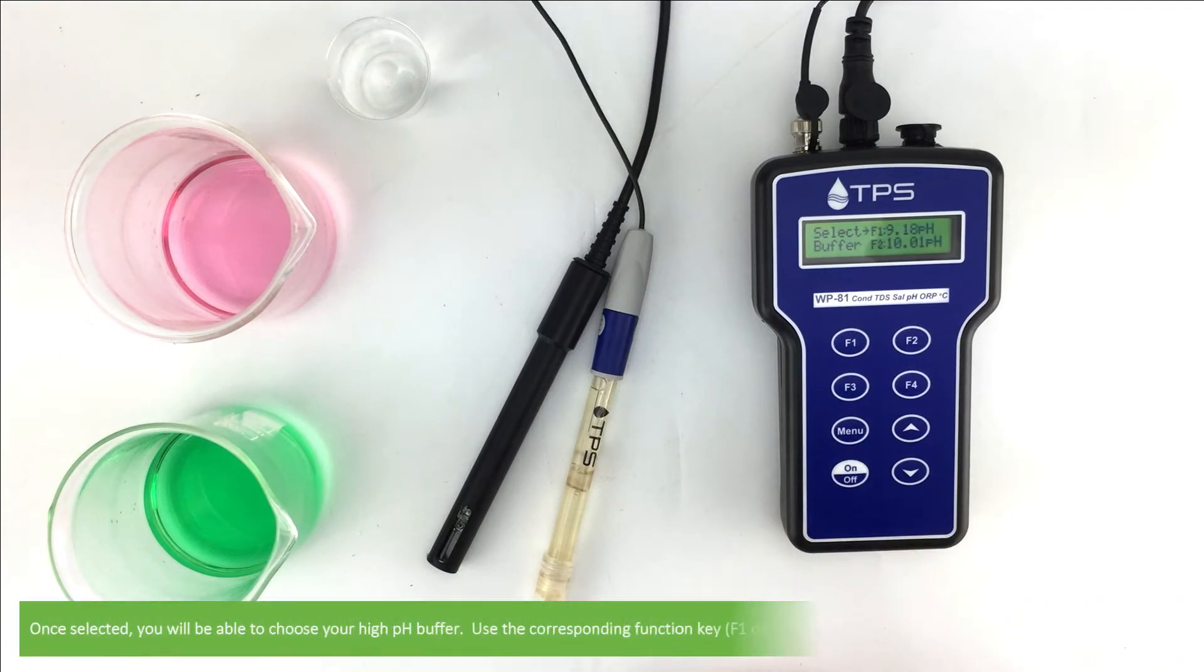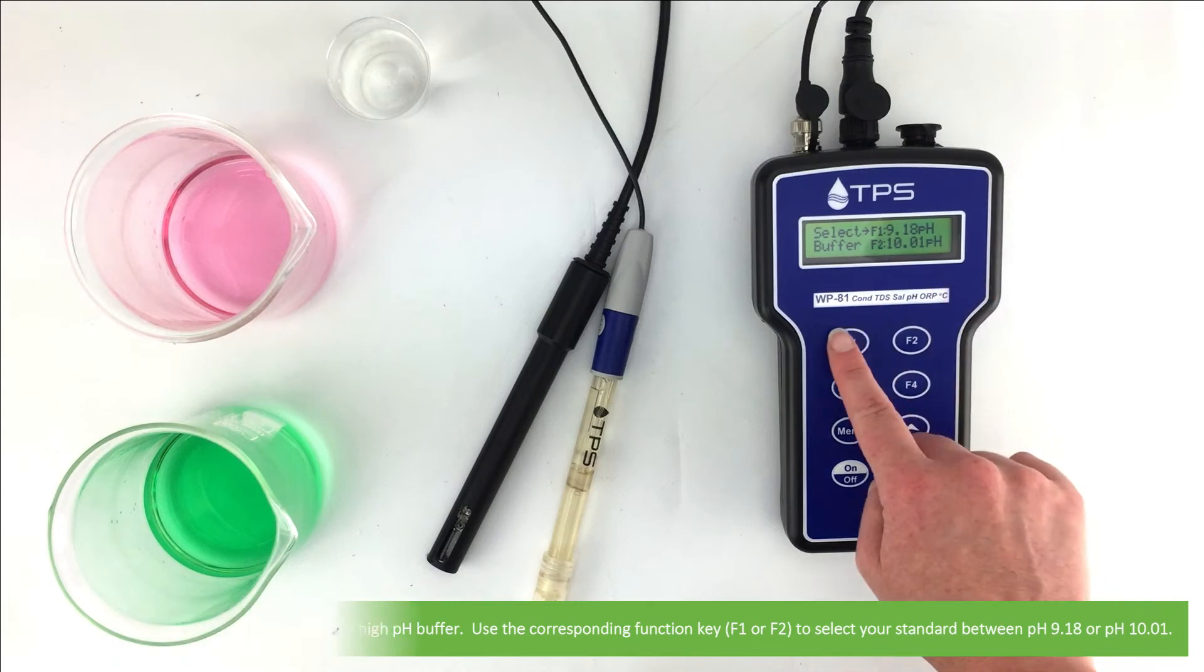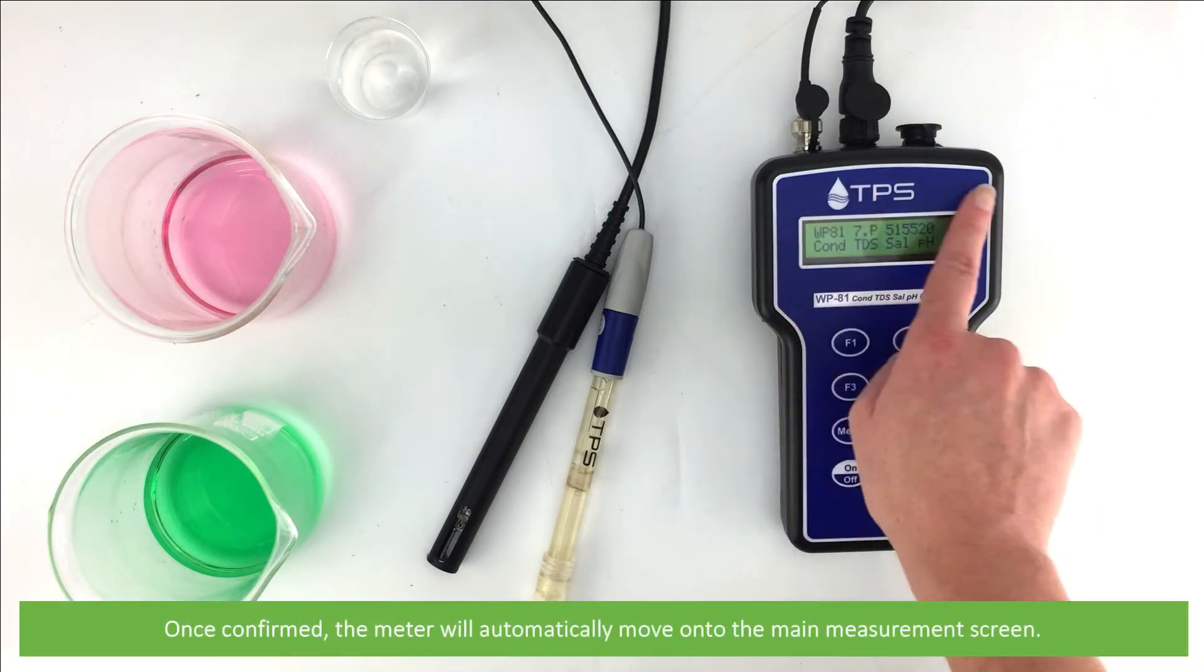Once selected, you will be able to choose your high pH buffer. Use the corresponding function key, either F1 or F2, to select your standard between 9.18 or pH 10.01. Once confirmed, the meter will automatically move on to the main measurement screen.